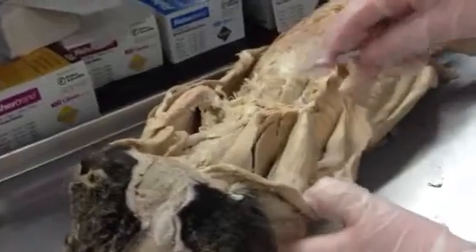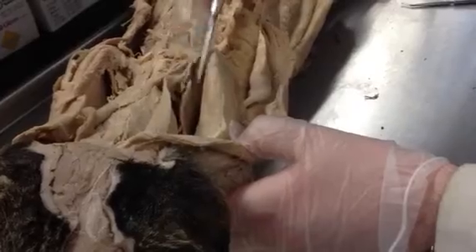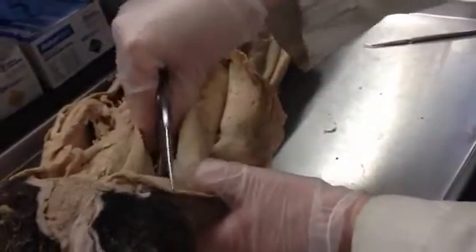So the levator scapulae is here between the subscapularis and the splenius. This flapper muscle here is the levator scapulae. It's actually a continuation of the serratus ventralis — if you follow the serratus ventralis, it actually continues as the levator scapulae on the other side.